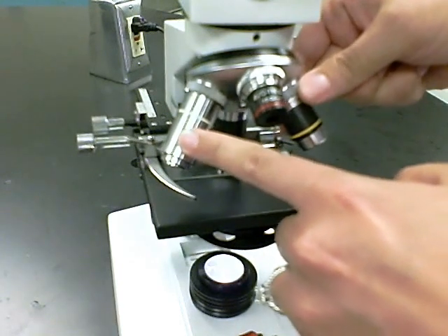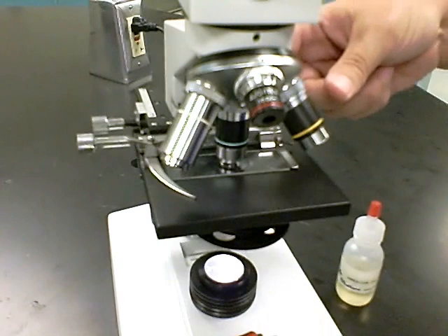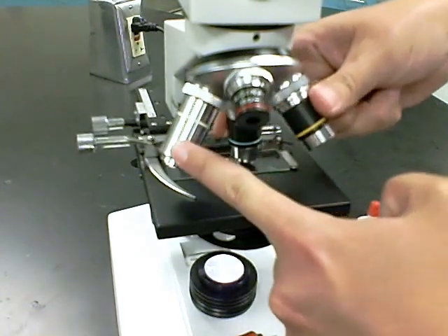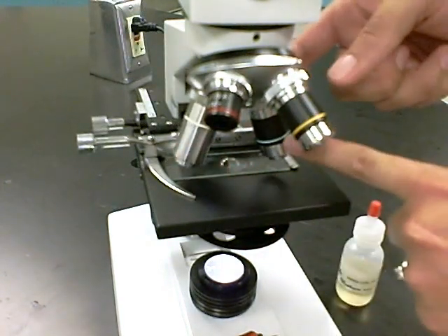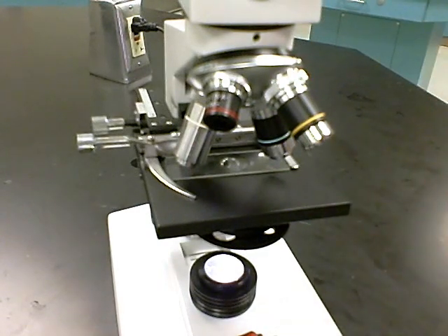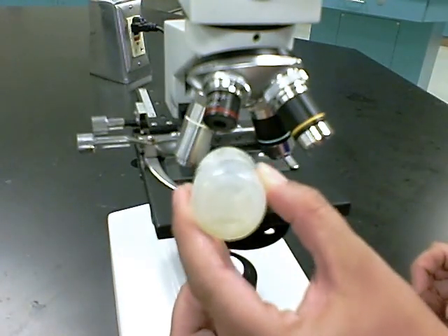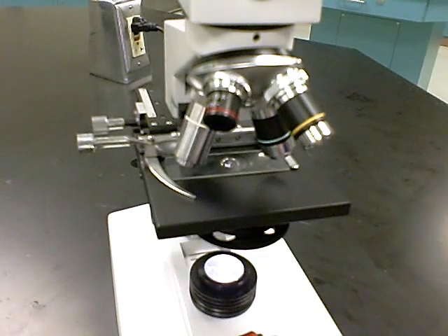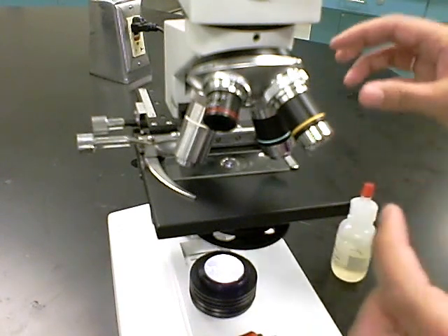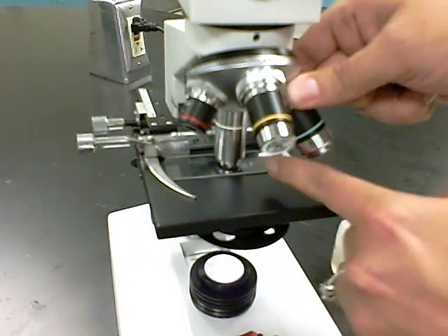So when you have your specimen in focus at 40x, the way you use oil immersion is you will swing this to where you're halfway in between your 40x and 100x objective, and you take some immersion oil and just simply place one little drop of oil right where the light is shining on the slide. You do not need a lot of oil, just one drop will be fine. And then you'll swing this 100x objective directly into the oil.